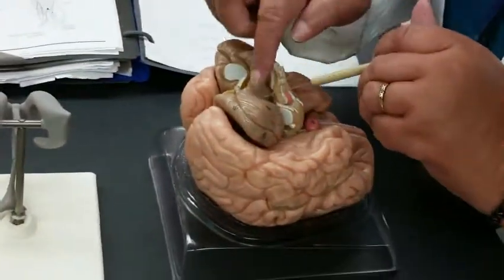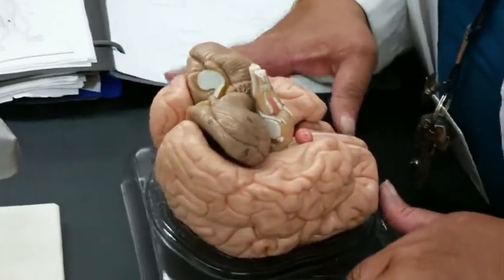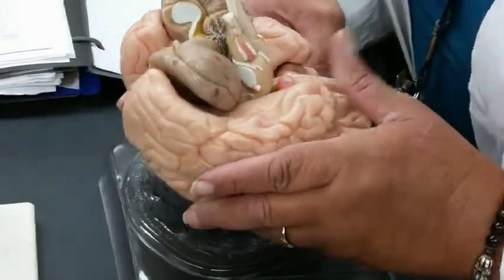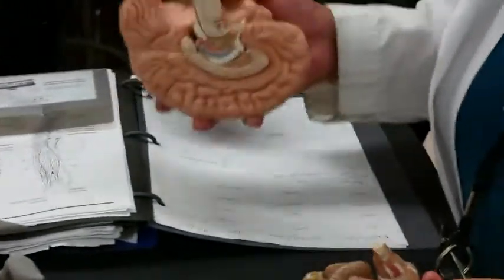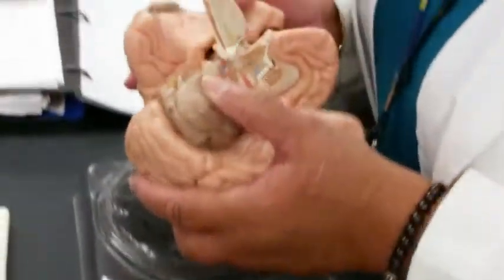Behind it would be what? In brown is the cerebellum. Now the brain has two hemispheres, right and left. So now I am separating the brain into two halves. This would be the right cerebral hemisphere, and this would be the left cerebral hemisphere.